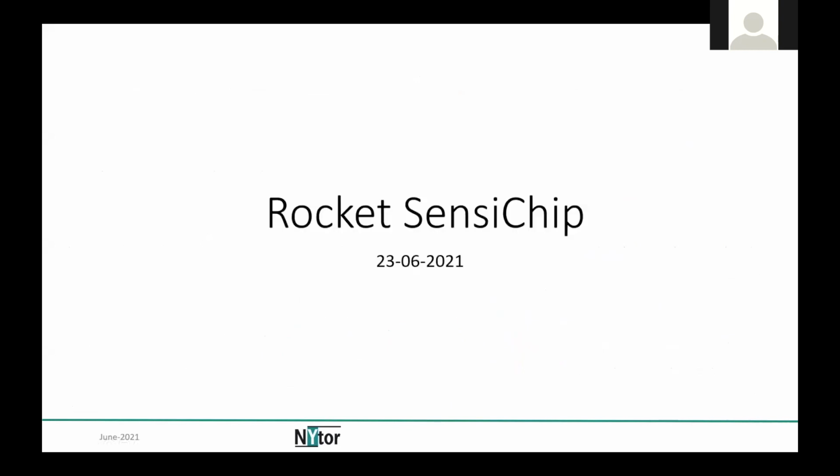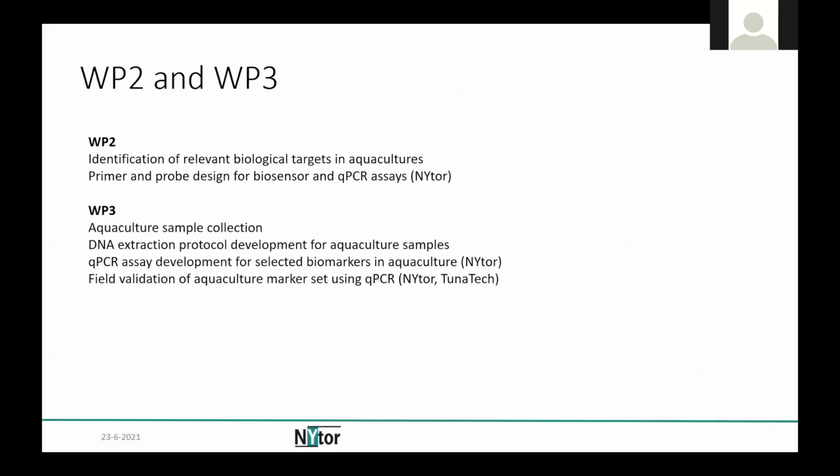So my name is Lydia van Laar and I work for NITOR, and I was responsible for the development of the qPCR assays and also the probes for the chips for curing. I think a bit similar to TUNATEC, we were also involved in work packages 2 and 3. So the design of the probes and the qPCR assay, and also the field validation of the samples that were offered by Florian from TUNATEC.